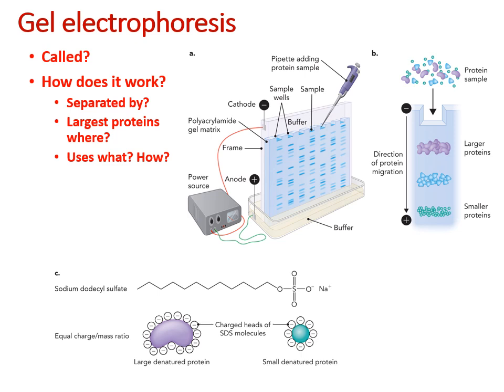Now, the way that this works is you end up using what's called polyacrylamide gel electrophoresis. When it's for proteins instead of DNA, DNA will use an agarose gel and you'll see it flat on the table, whereas for protein gels, you'll see them standing up and they'll be called PAGE, for polyacrylamide gel electrophoresis. And it's going to separate out the proteins in a sample based on charge and size.